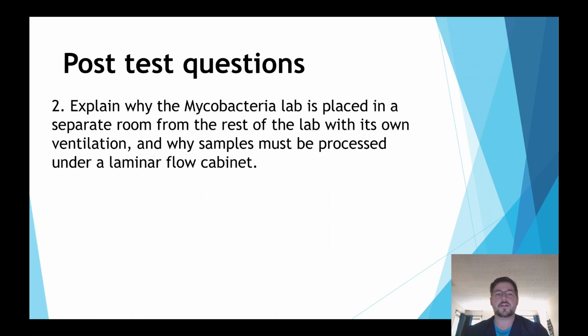Question 2. Explain why the Mycobacteria lab is placed in a separate room from the rest of the lab with its own ventilation, and why samples must be processed under a laminar flow cabinet.